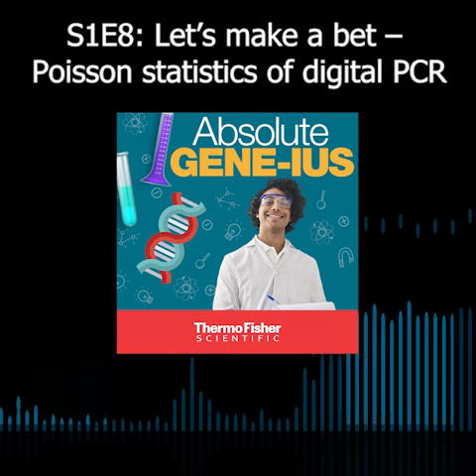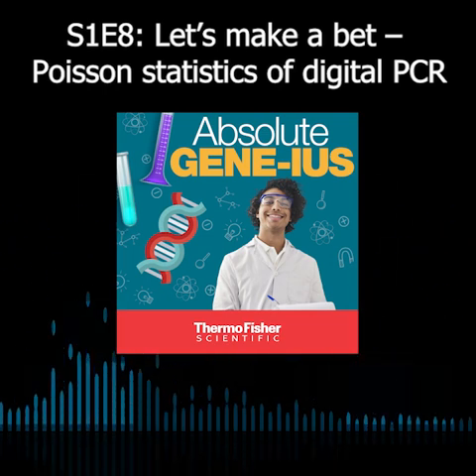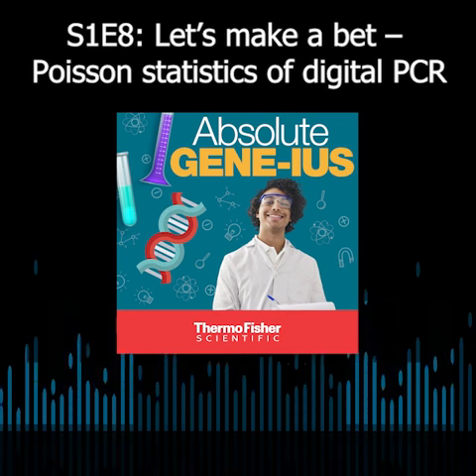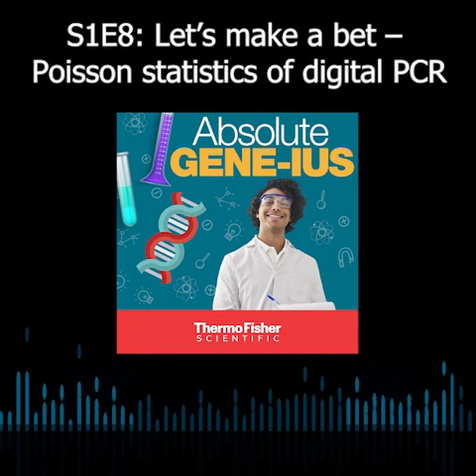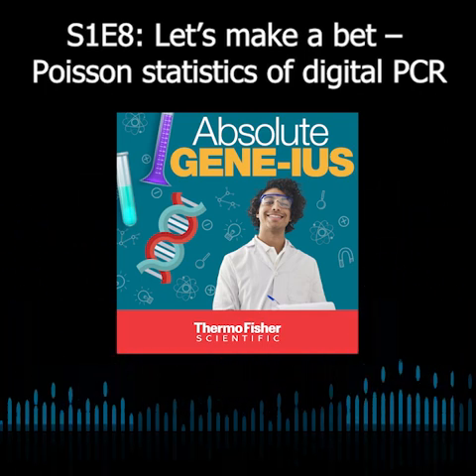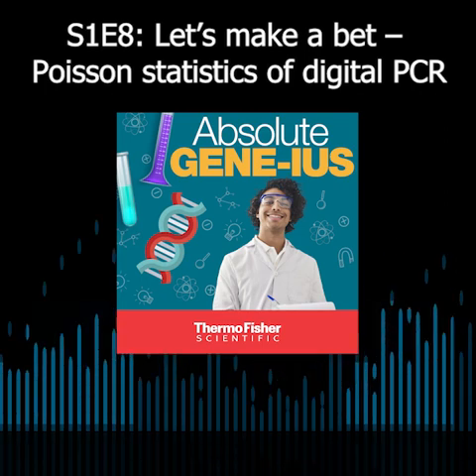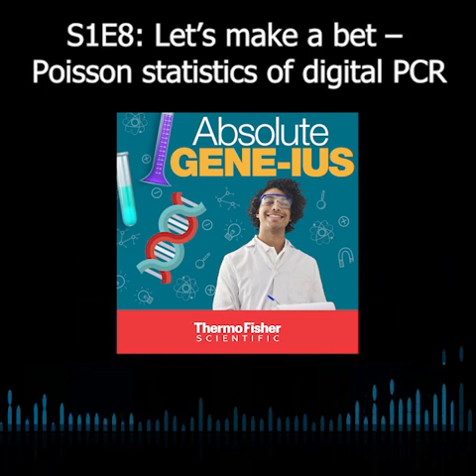And it sounds like reaction efficiency, while still playing somewhat of a role in digital PCR, is not necessarily as critical as, say, in qPCR, where if you have inhibitors, you may actually see a large shift in CT value that can affect your concentration calculations. Is that a true assumption?